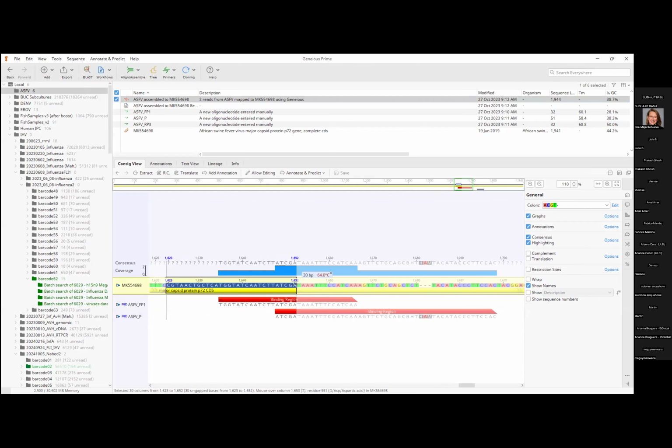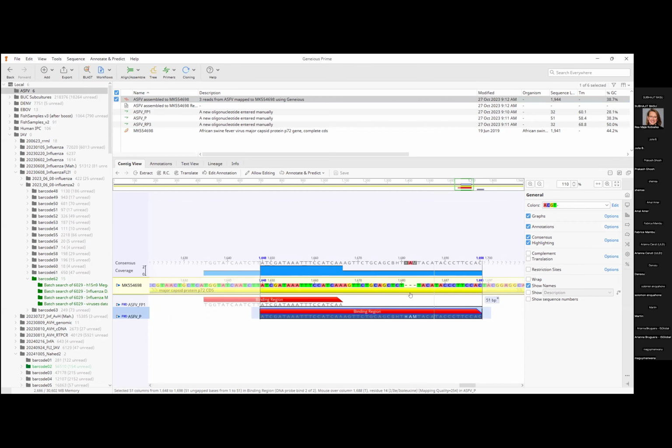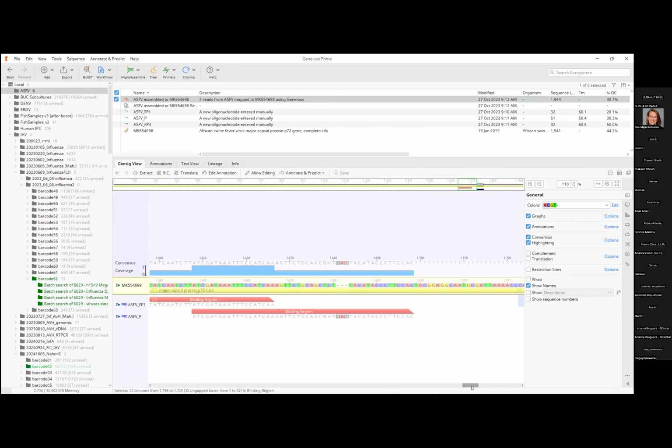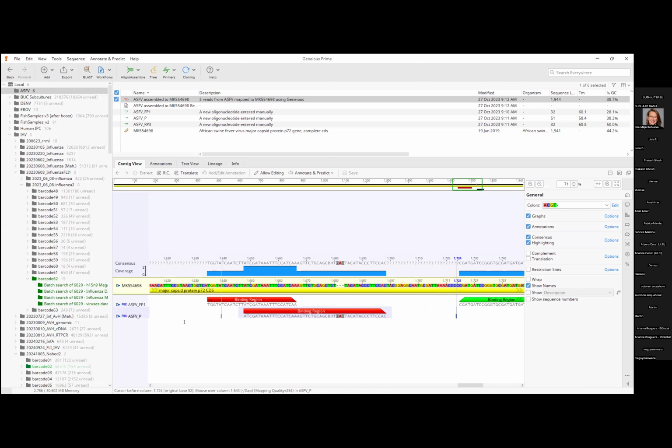You can just select, for example, in this case, 32 base pairs of a primer that I will use for my African swine fever region, a probe in the middle that fits the probe needs, and a reverse primer. So this is super simple. You don't need a premium version. You can just select sequences, look into it, and maybe look for primers, for example. Very, very common thing to do in our field, right? So this is the first thing, very simple.